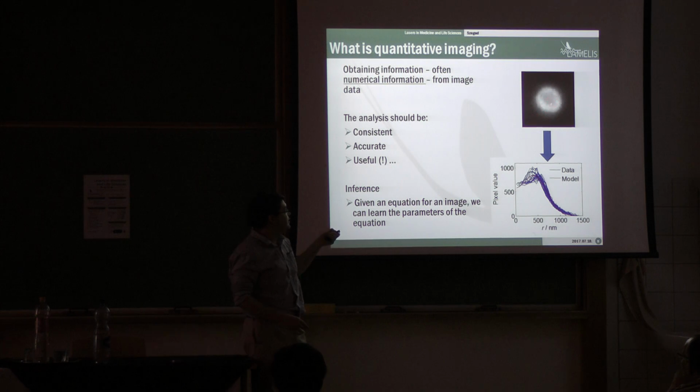This is actually a bacterial spore related to some antibiotic resistance research that I'm interested in. But part of my research is, well, we take images. Actually, an important part of my work is what I call quantitative imaging. So we want to distinguish an image from a conclusion that we need to write in scientific papers. There's a saying in statistics that data is not information, and information is not knowledge.